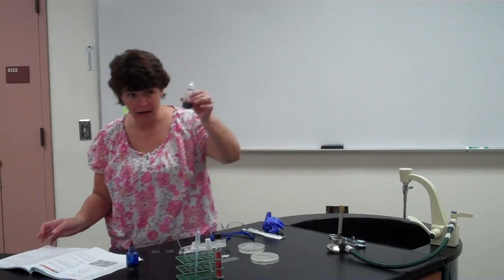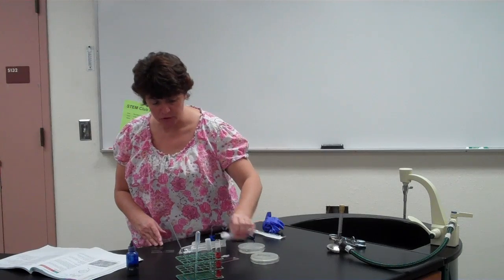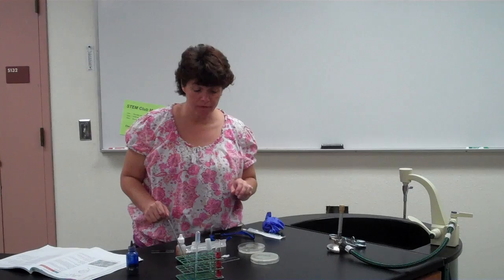sporulation if it looks fuzzy, and then you're going to take a sample of it. So after these have grown for the week, and so if you're a 2-day class, you're not going to look at these plates for a full week. Okay, so if we start on Tuesday, you look at them the following Tuesday. And then from the plate, you're going to be taking a sample. So just like we did with the blue solution, this time we're going to use an iodine solution. The same thing, you're going to put a drop of it on the slide. You're going to add a loopful of the culture, put a cover slip on it, and observe.